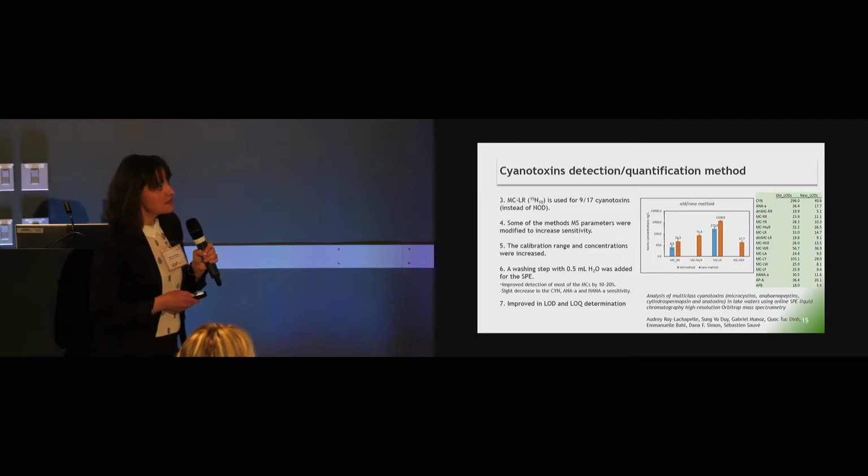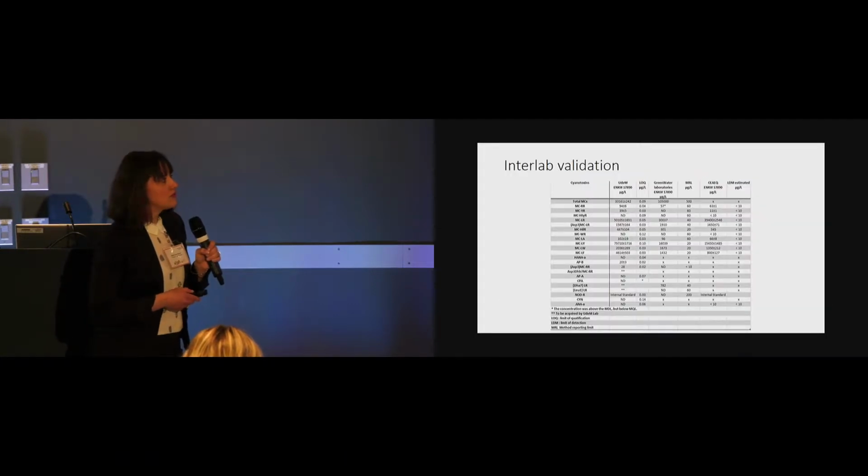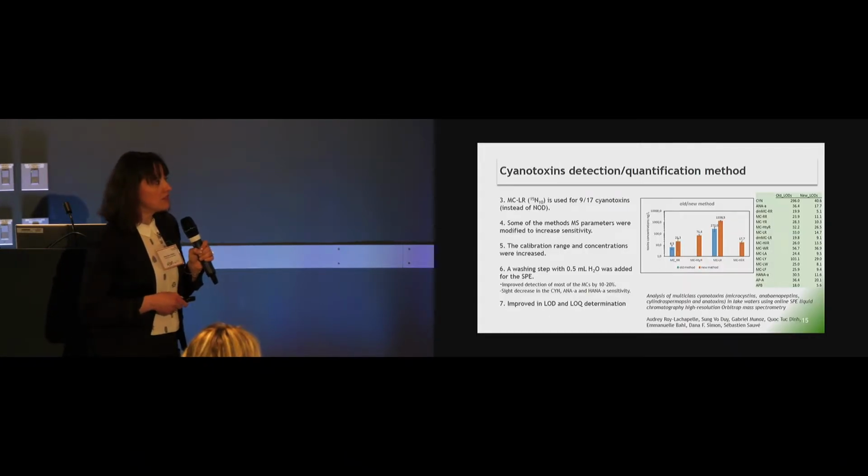This is the slide where I show what the changes are. Here we have the old LODs, and that's the new one. It shows that they are a little bit more sensitive. And this ended up being a publication written by Audrey, which is good.